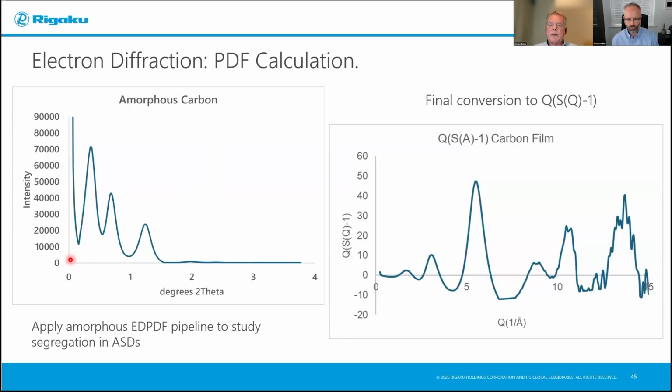It's like any diffractometer, X-ray, neutron. We can look at amorphous systems, crystalline systems, liquids, gels, whatever needs to be studied. And this is exporting the amorphous carbon diffraction data, the three-dimensional reciprocal space data, as a powder pattern. Very beautiful, very clear. And also notice down here that the powder pattern is done by 4 degrees 2 theta.